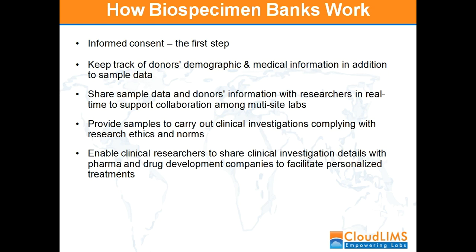Associated information like pathological, demographic, social, and follow-up data are collected and linked with the stored samples. Also important for biobanking is the time of storage. Samples should be stored within 30 minutes, because once the biosamples are detached from the body, a hypoxic condition is generated in them, a lot of genes start to express, and other proteins and biomolecules start to degrade. So it is important that samples are stored within 30 minutes.